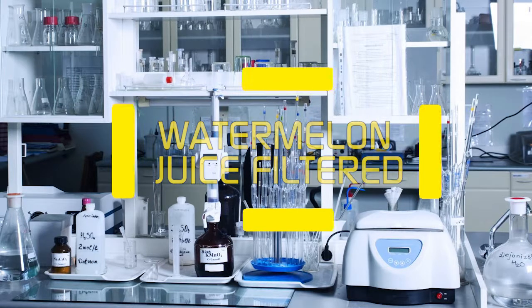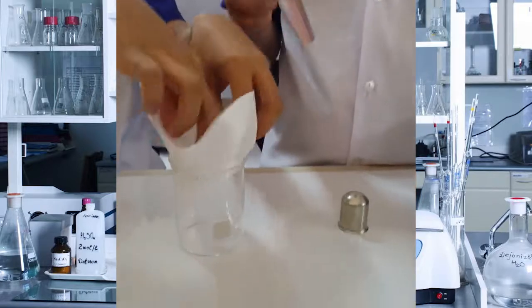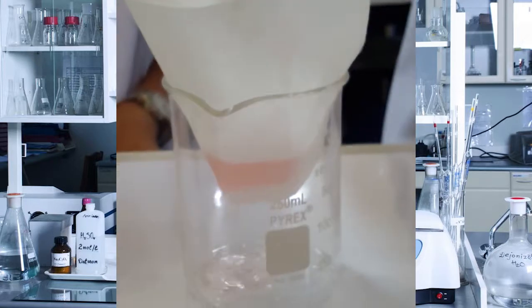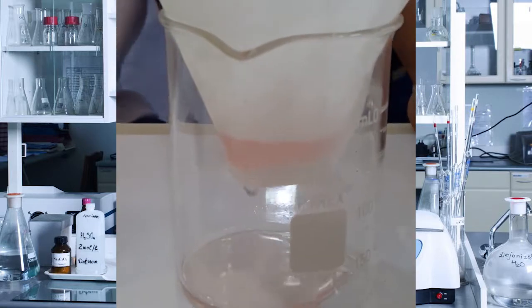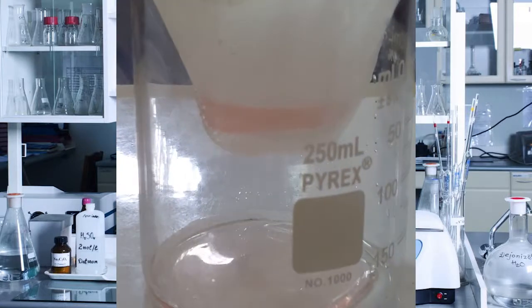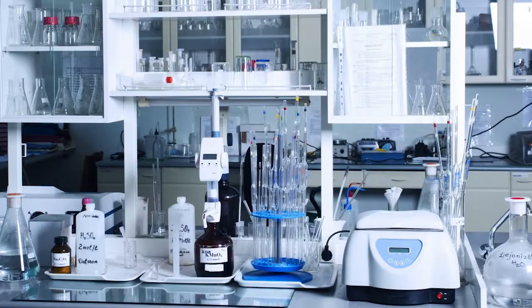We have a filter paper and a beaker, and our substance is watermelon juice. Watermelon juice is a heterogeneous mixture. We put the filter paper on the top of the beaker and pour the watermelon on it. As the watermelon is poured in the filter paper, we can see there are small particles of watermelon left in the filter paper.